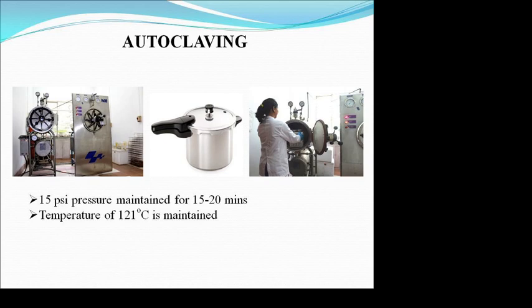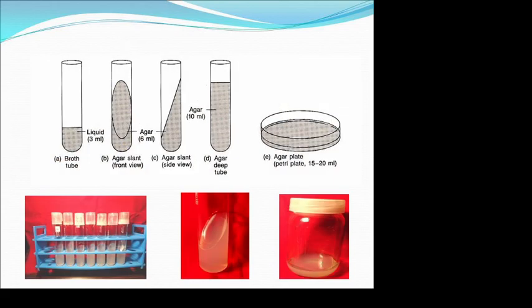One thing is very important, I keep stressing it: it is basically to get rid of any contamination. In plant tissue culture, the biggest threat is contamination, so you have to be very careful while working in this environment. Once the medium is prepared, we go for slant culture. You can see the slant culture in the slide. A slant is prepared to increase the surface area for the explant. Remember, the explant that we took from the mother plant will be cultured or inoculated over here. Even agar plates and jam bottles are used. These are different ways depending on the requirement.